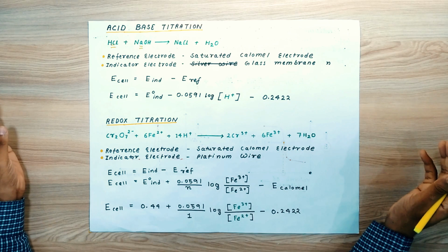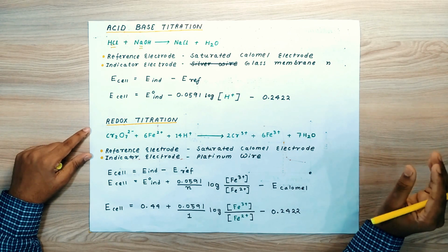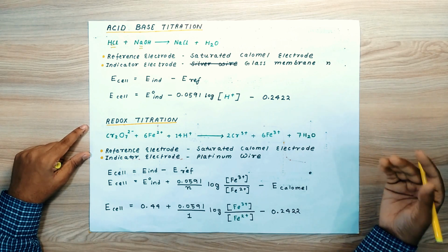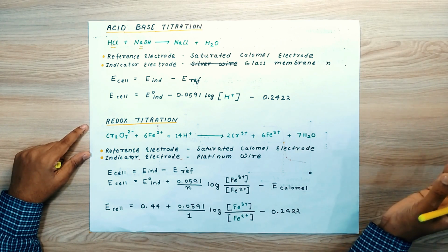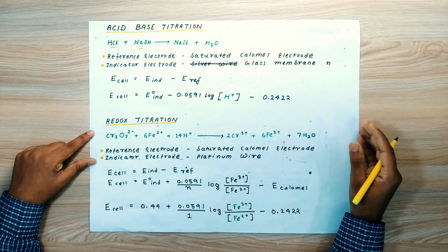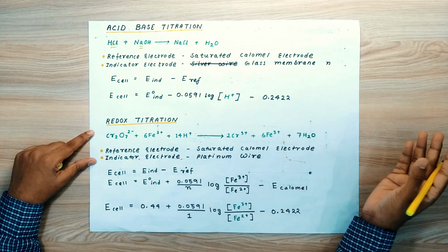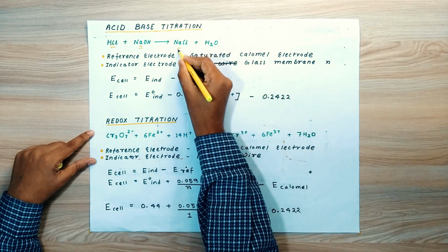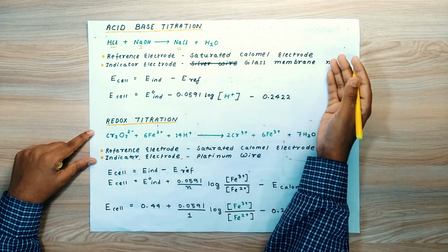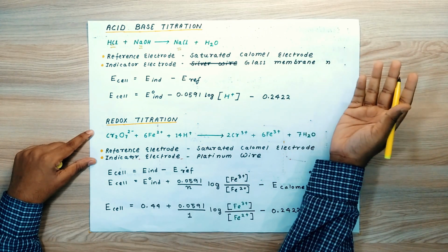Here we will not do it like that. Here we will apply potentiometry, that is, we will observe a change in the potential in the potentiometric device. As we know, during titration the HCl reacts with NaOH to form its respective salt, that is NaCl. When all the HCl gets used up to form this NaCl, that point is our endpoint.